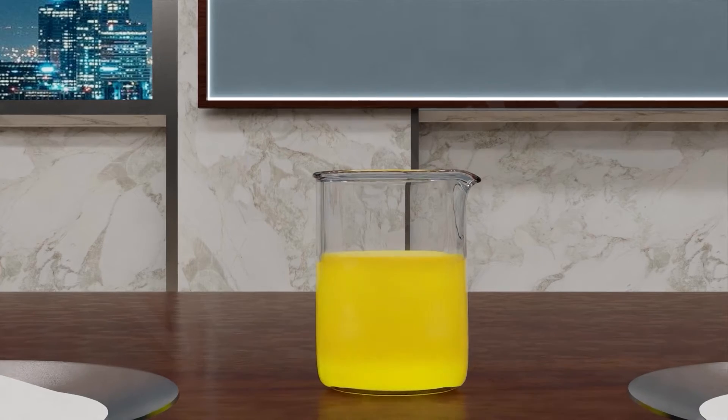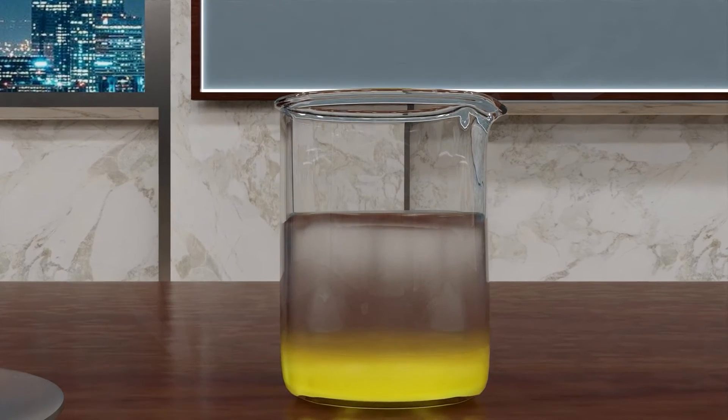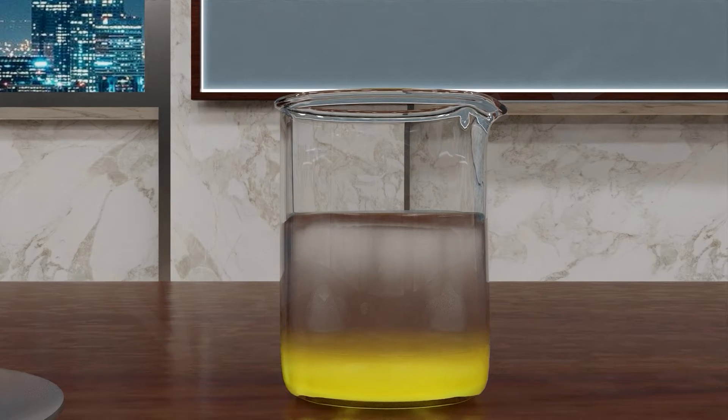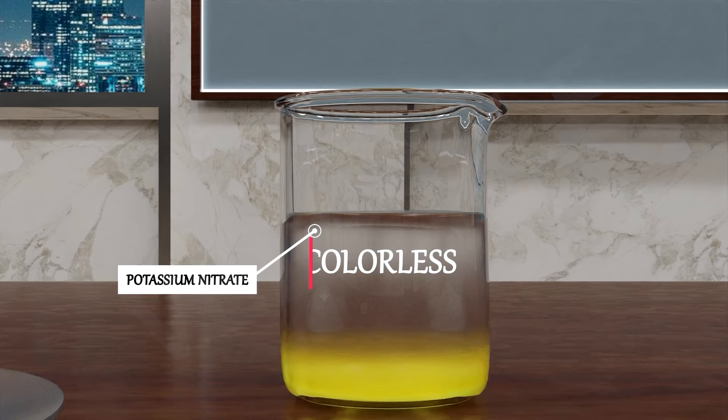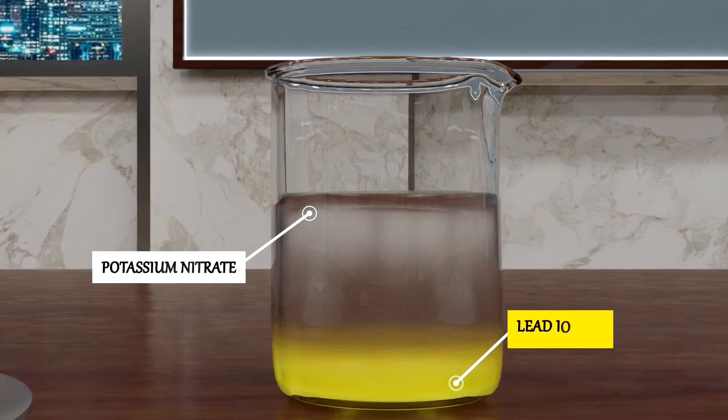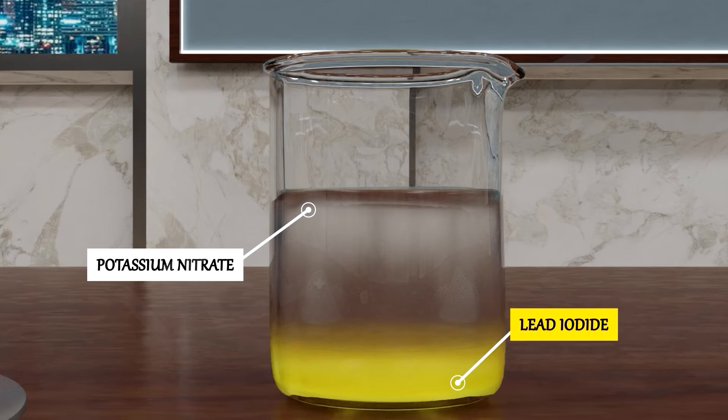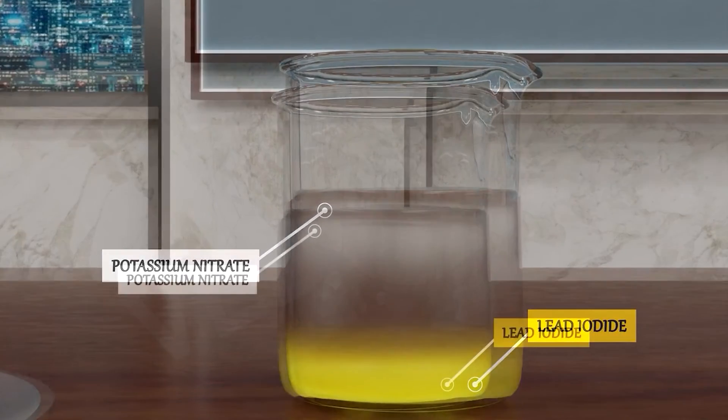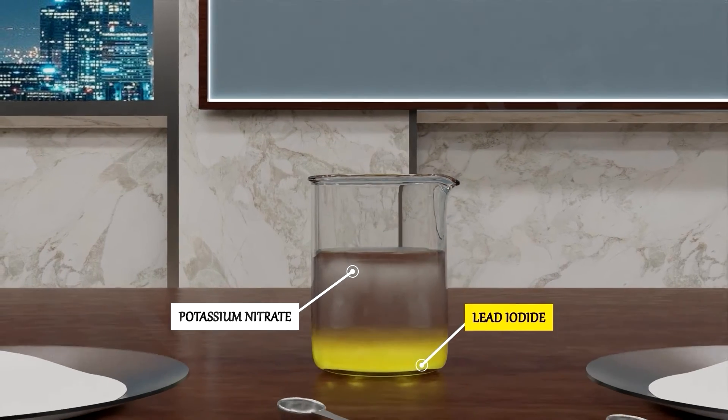Now let it be settled for some time. As we can see here, the upper side is colorless. This is potassium nitrate. But what is the color of the lower side? It is yellow. This is lead iodide, and it is insoluble in water.